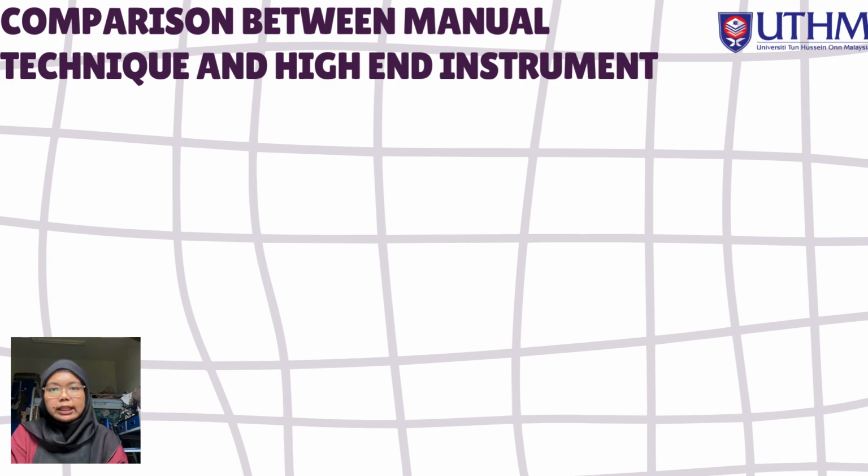But the disadvantage is that it lacks specificity, and cannot distinguish between structurally similar proteins like albumin and globulin. Also, purity and identity of protein are not confirmed, it relies on visual coagulation and pellet formation only, and is prone to inconsistency due to operator handling and external condition.